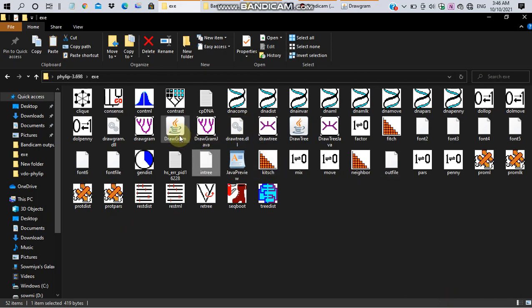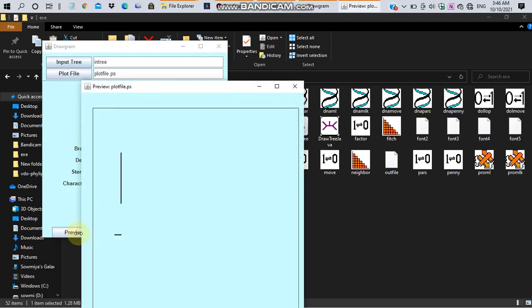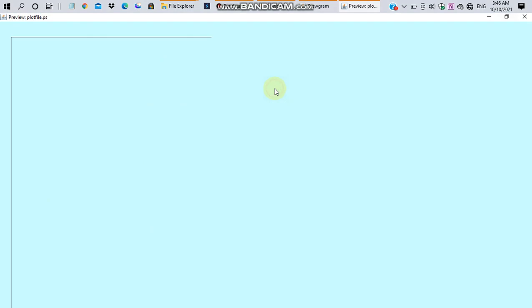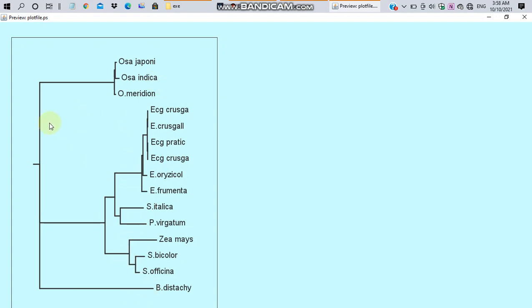For constructing rooted tree, go to drawgram. Click on the preview. You will get this tree. In this tree also there are two clusters and an outgroup. No significant change is observed between distance-based tree and character-based tree. Only the order is changing. Otherwise the closely related and distantly related groups remain the same.